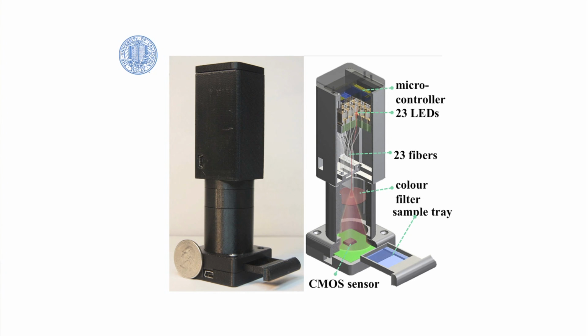So you load your specimen from the side, and at a given time, only one LED is on, and this CMOS imager here, which is, let's say, a 5 megapixel imager, the previous generation, records a hologram for a given LED. Then the LED starts to shift in the sense that we turn on different LEDs at a given time. Every time there's a single hologram that's being recorded. However, because of the location change, holograms digitally shift.